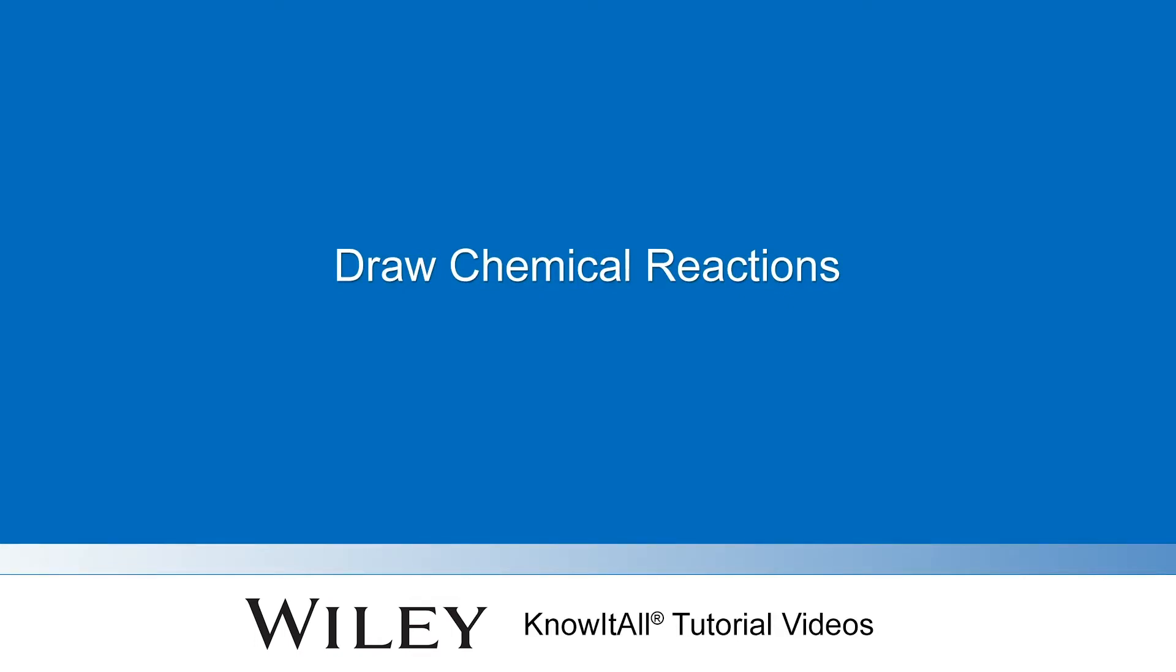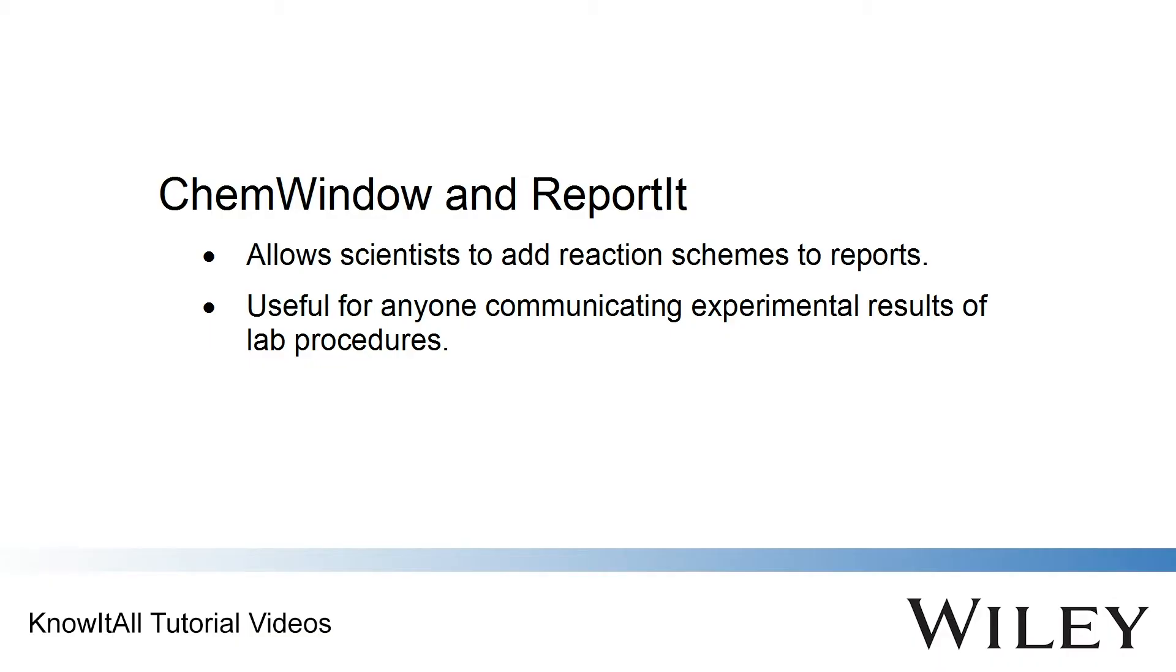Welcome to a demonstration of how to draw chemical reactions using the Know-It-All Informatics System. Scientists can use the Know-It-All Draw-It and Report-It applications to add reaction schemes to reports. This capability is useful to anyone communicating the results of laboratory procedures.